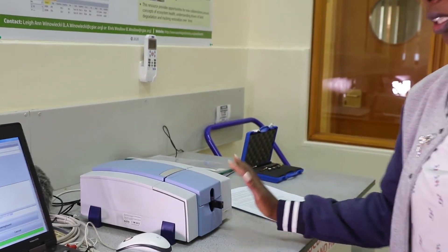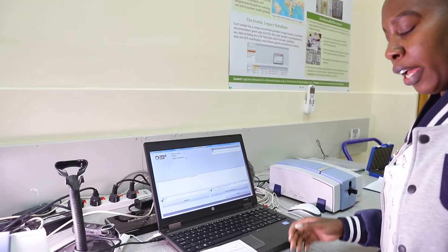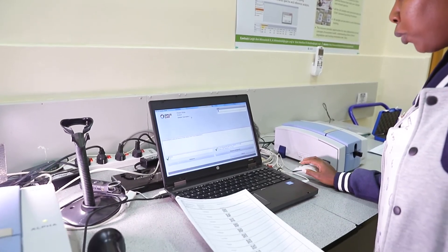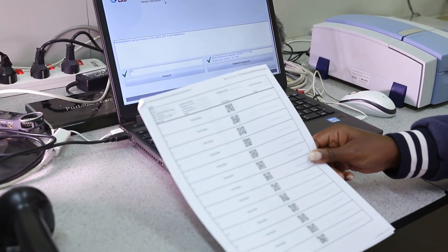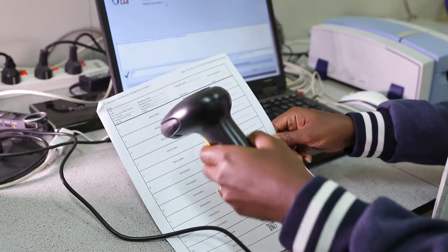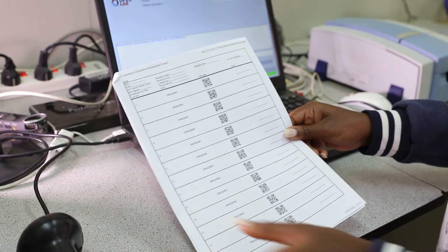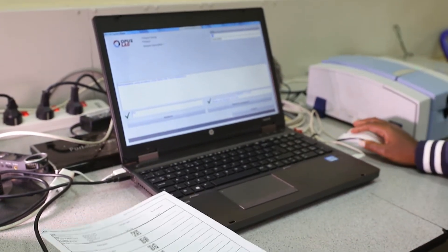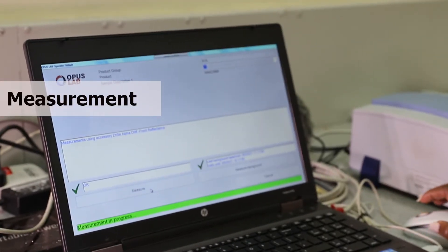You then come to the Sample Description. Before doing the sample description, note that each sample has a unique sample ID. We normally use a recording sheet which has a QR code and a QR scanner. You scan the first QR code representing the first sample, which will appear in Sample Description 1. Then click on the Measure icon, which will take 30 seconds.